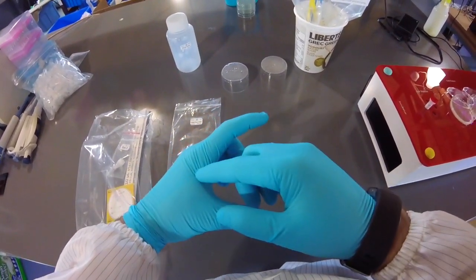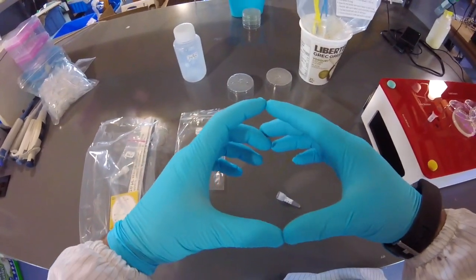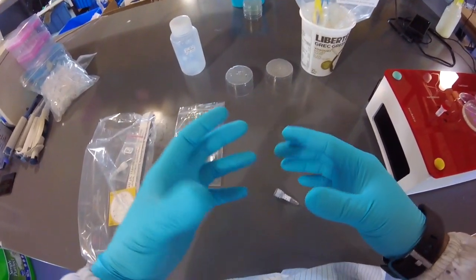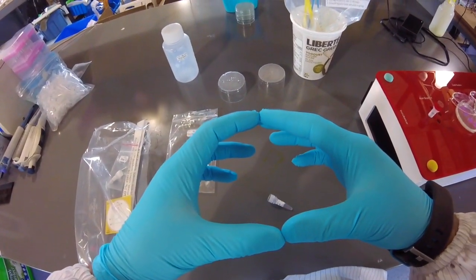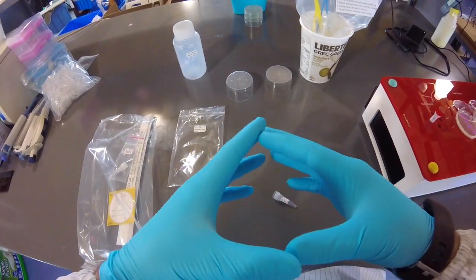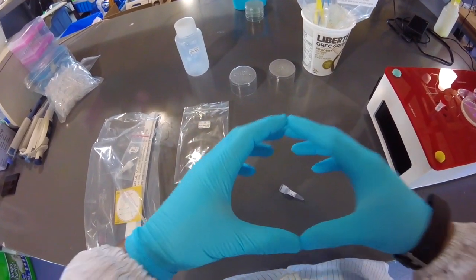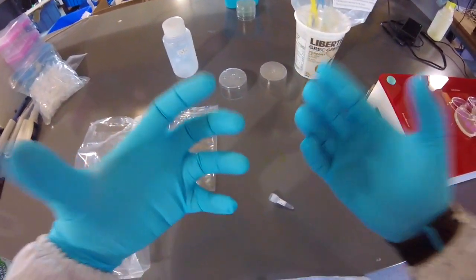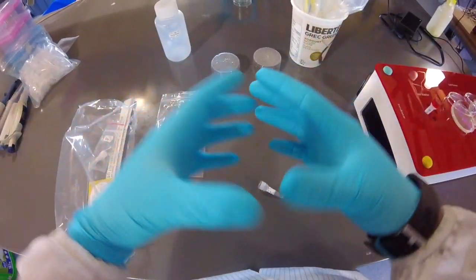There's also another gene, which is called a selection marker, all right? And there's many different kinds of selection markers. There's lots of different kinds of plasmids, but often these selection markers are a segment of DNA that will result in the creation of a protein enzyme, okay? That's a protein that's able to cause a chemical reaction. And that protein enzyme is typically able to break down an antibiotic, okay? Because this plasmid also has that gene in there, it will allow the cells to be resistant to the antibiotics in the plate. It'll cause the creation of a bunch of protein enzymes, which are kind of like a defense layer within these bacteria cells that protect them from the antibiotics. They keep chopping down the antibiotics as they are entering the cells, okay?